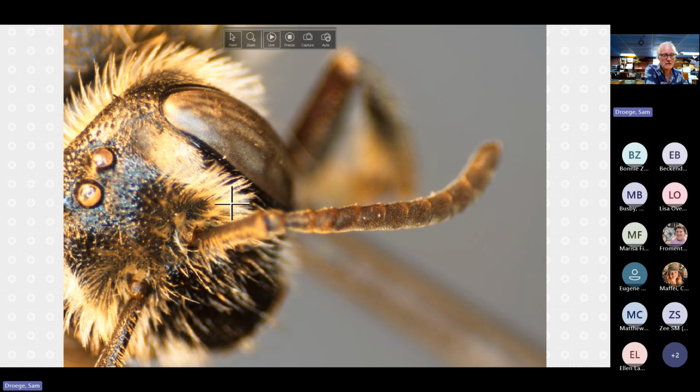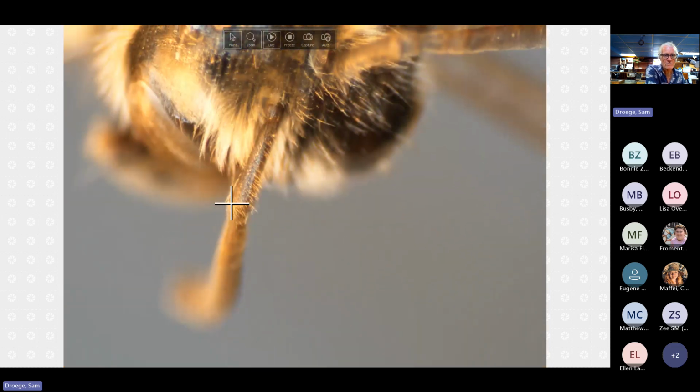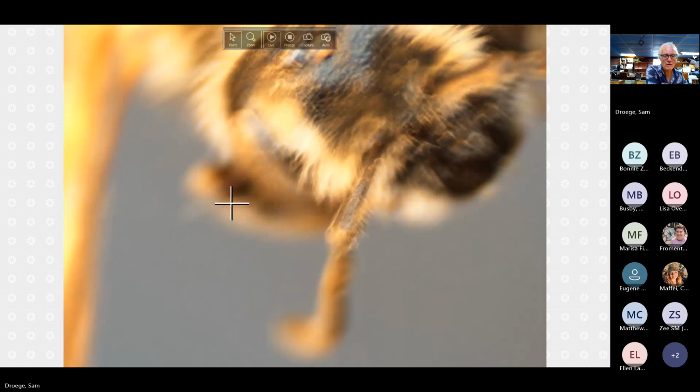So let me see if we can see this better. We'll see it on others. Here's the other side.